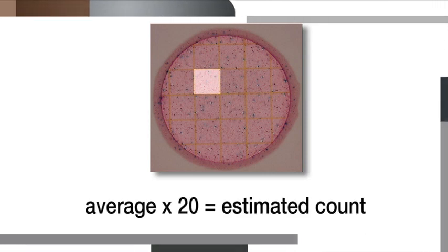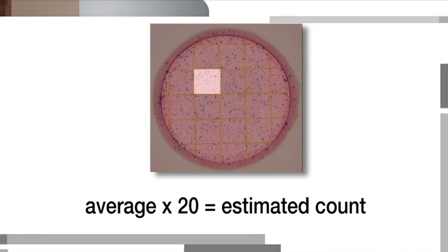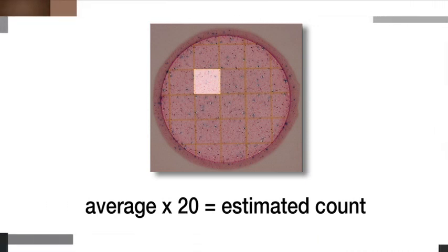To do this, first count the total colonies in one or more representative squares and determine the average number per square. Multiply that number by 20, which is the inoculated area of the plate. The result is your estimated count.